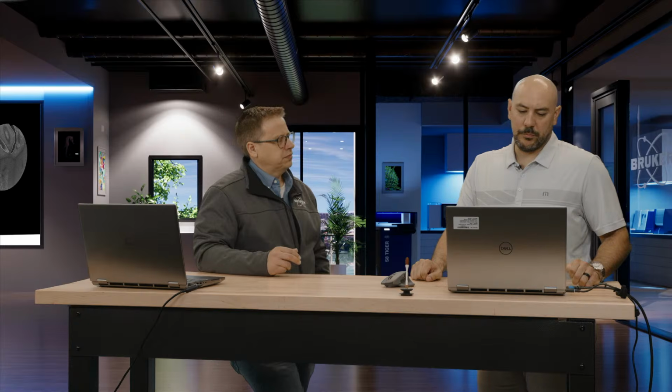The other thing is that the really high quality CMOS scan is a 24-hour scan. So you also have to justify: do I have the time for that? Do I need to do that? Is that going to benefit me in any way? Sometimes the answer is yes, but probably there are more times where the answer is no. You don't necessarily need to do that. You need to think about, like you said, justifying your time usage. Are you answering the question that you want to answer?